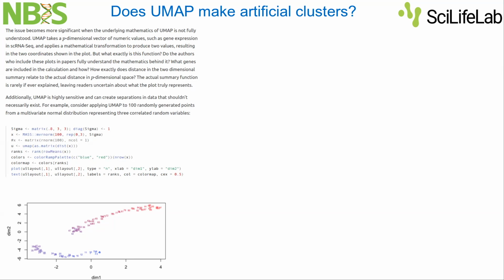I don't think it's based on UMAP. You do clustering, right, when you detect doublets. No, actually, in my lecture, I was showing that when you visualize cells in a UMAP, you sometimes get these streaks between two clusters that are doublets, cells that are a mixture of those two cell types. It looks like a trajectory between two clusters, but they're actually doublets.